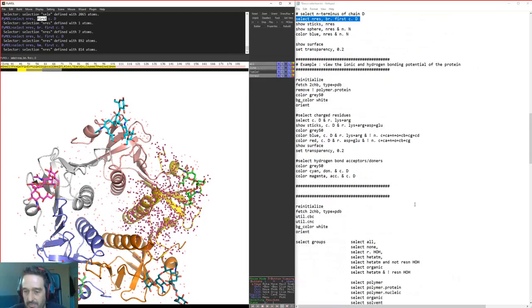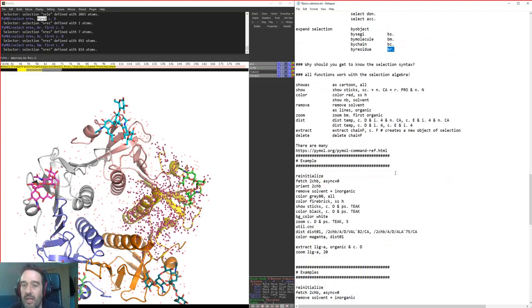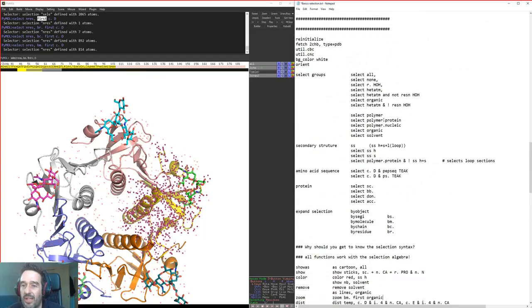Let me just see. You can type by object, but of course there's no need to ever do that because you could just select the object. But these selectors to expand from a smaller selection can come into their own in other ways later on. Now that's all very interesting, isn't it?